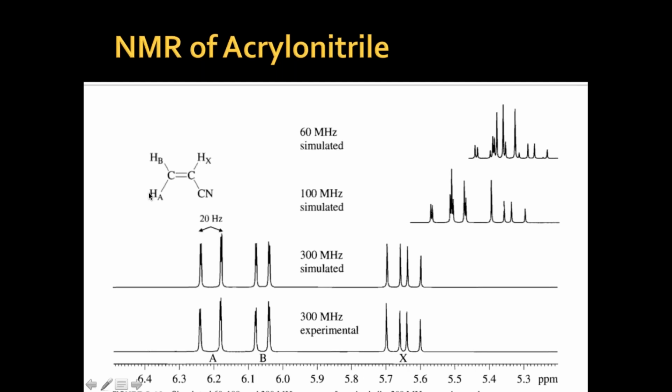Remember one thing, the trans coupling is higher as compared to the cis coupling. What does that mean? Coupling means the trans protons will be wider, farther away from each other as compared to cis. You can see here.